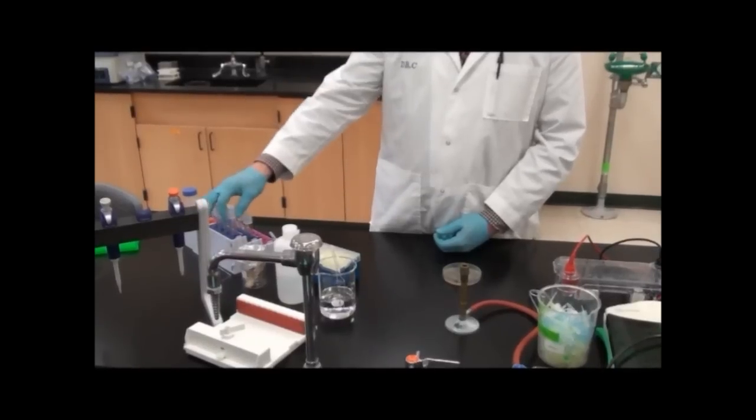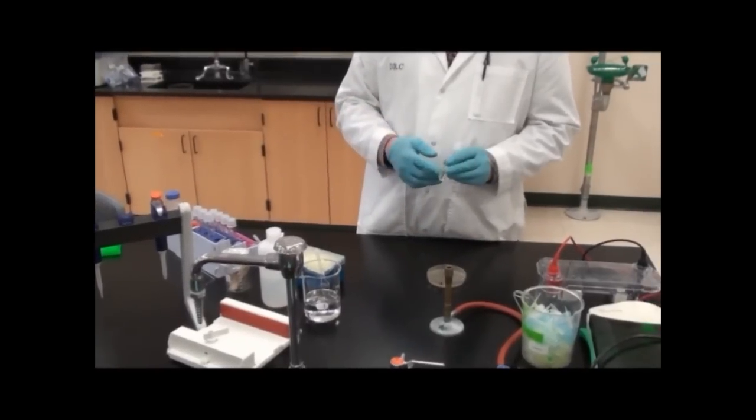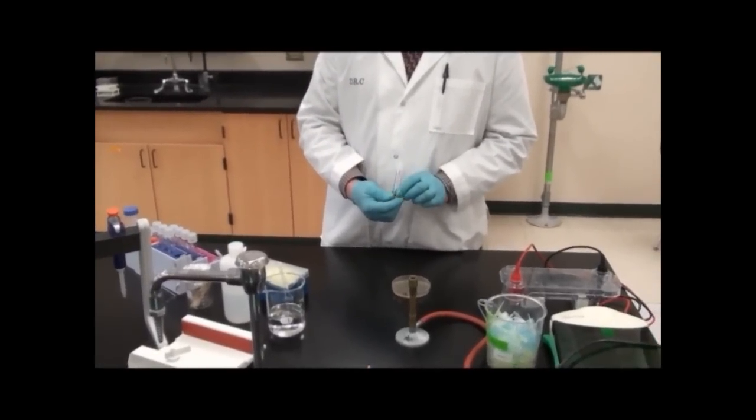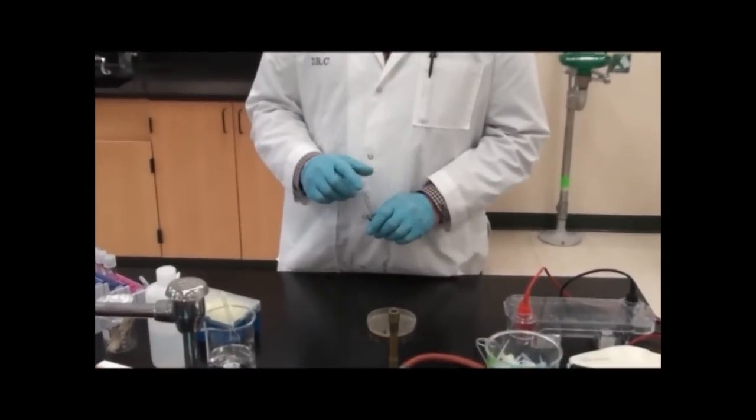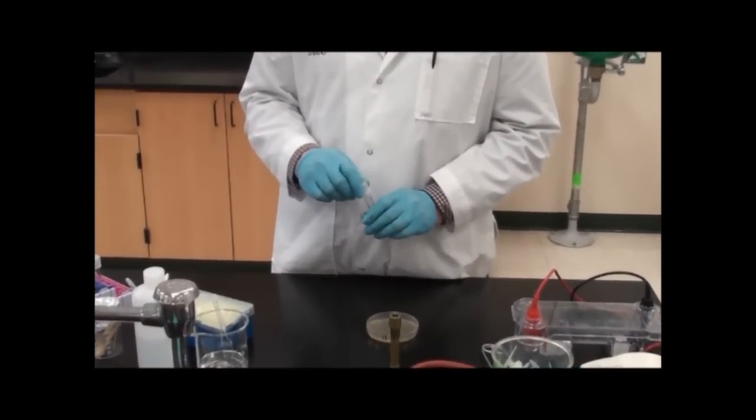That's how we'll start our culture to isolate our plasmids. Our next step is we'll grow this overnight and this will be full of a bacterial suspension. We'll harvest those bacteria and then isolate plasmids from them. That will be the plasmid isolation step.